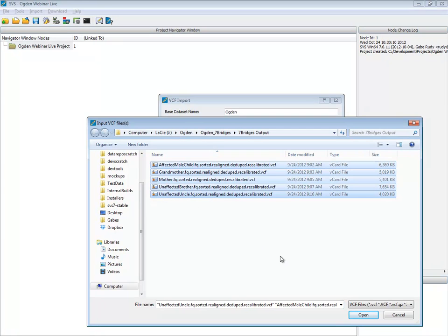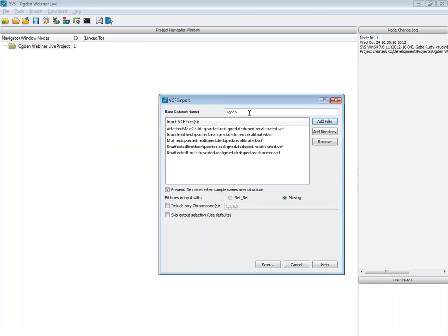So I'm going to go ahead and select all of my VCF files here. I gave the files a base name. Two options to keep in mind. Because we're having the VCFs produced in a manner where there's a single sample in each file, each is going to contain just the list of variants for that sample. So if one sample has a variant and another doesn't, there'll be a hole in the spreadsheet that needs to be filled in.